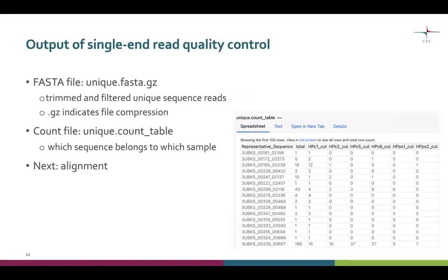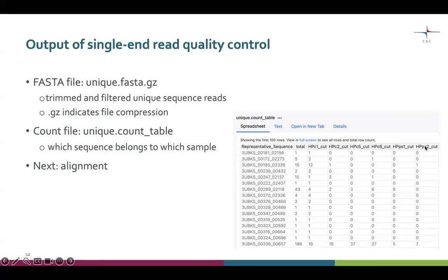Now we are ready to proceed. As output of quality control, filtering, and trimming, we have a FASTA file with our filtered and trimmed unique sequence reads, and a count file which tells which sequence belongs to which sample. Here you see an example of a count file at this point — in the rows we have each representative sequence, in the columns we have all the samples, and the numbers tell in which sample and in how many copies each sequence read occurs in our data. We are now ready to proceed to sequence alignment.